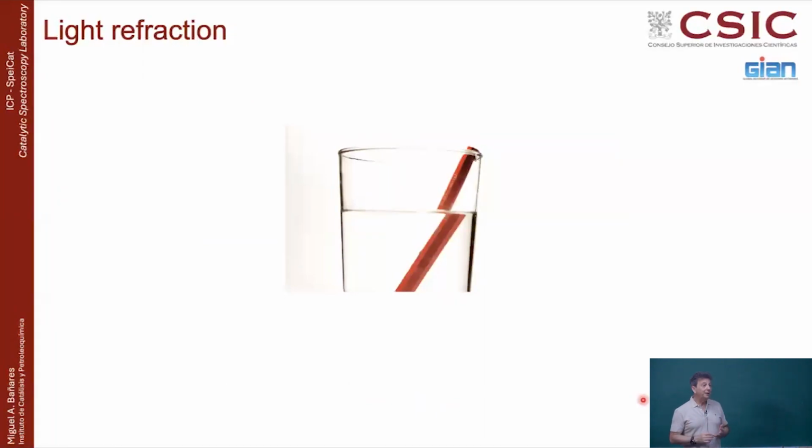Now, you want to make a confocal microscopy. You have the microscope here in the air, you have the sample here, and the sample is not air, but between the microscope and your sample there is air, maybe a few millimeters or nearly touching, but there is air. Is it important that we are looking through air to a material? Because typically, you're looking from the microscope here in air to a sample here, and you focus on the surface. But now I want to focus inside. Can there be any problem if I try to look inside the solid?